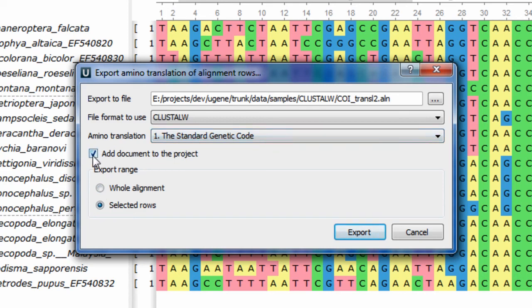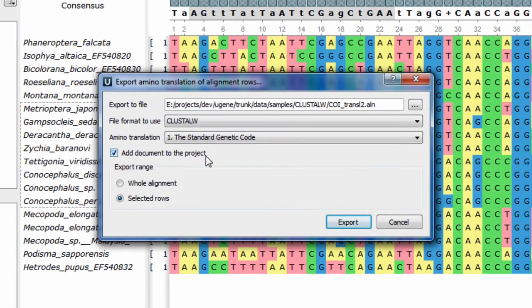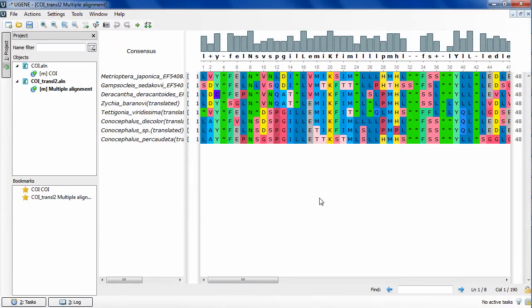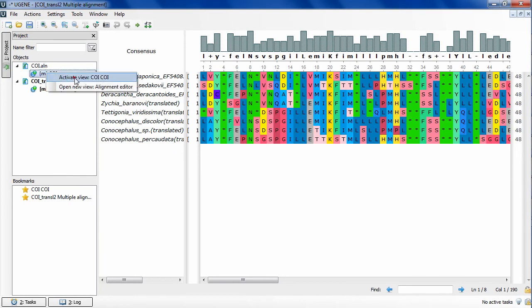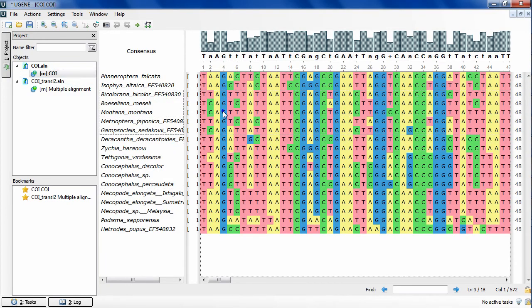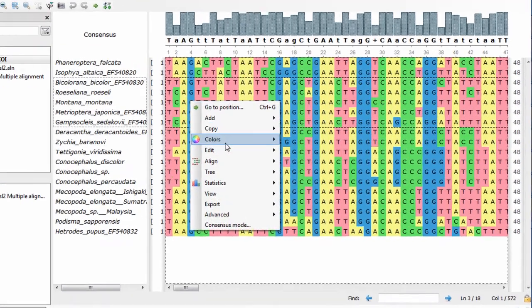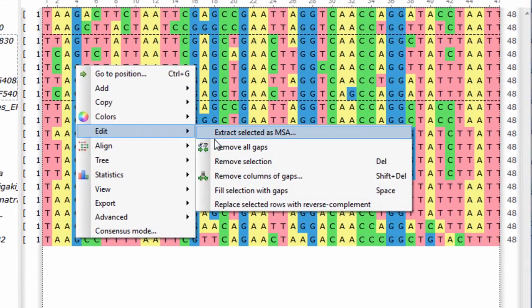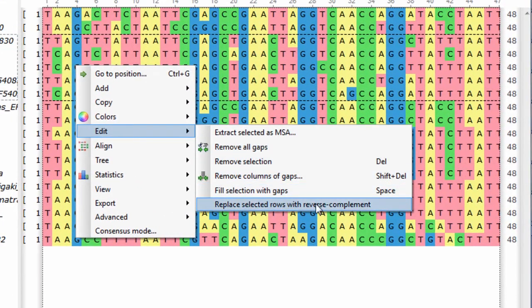Also you can replace selected rows with the reverse complement ones by selecting the corresponding context menu item of the selected rows area.